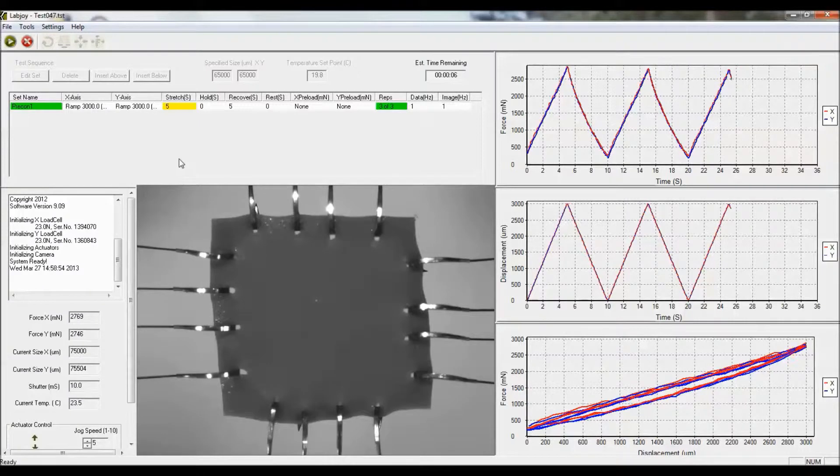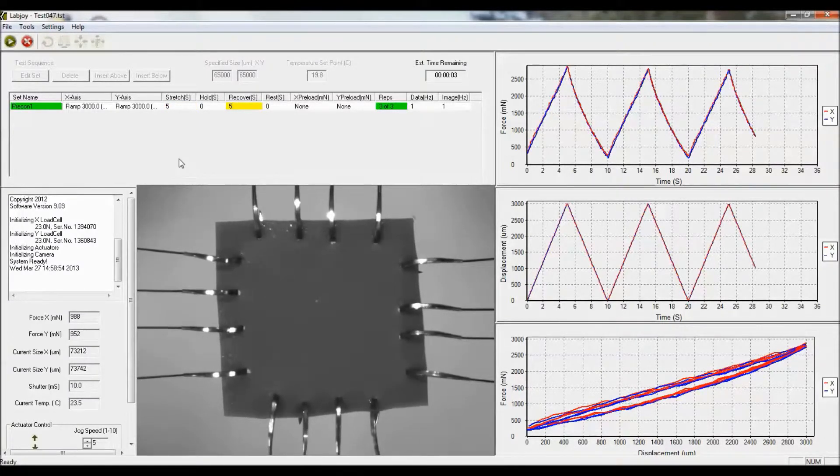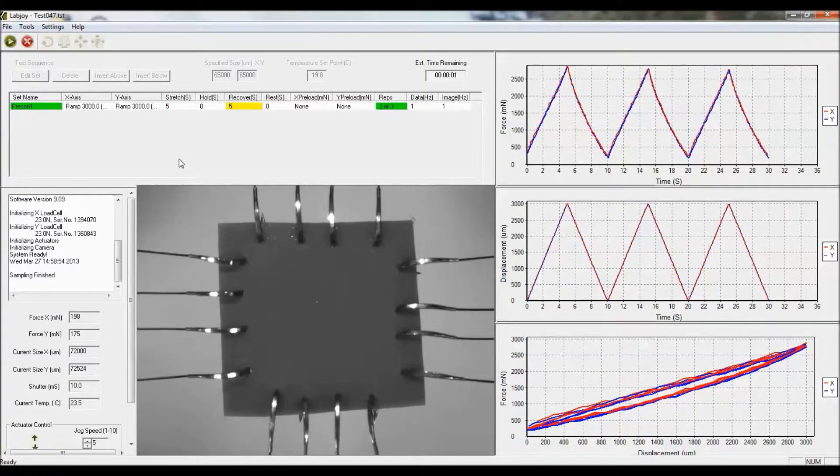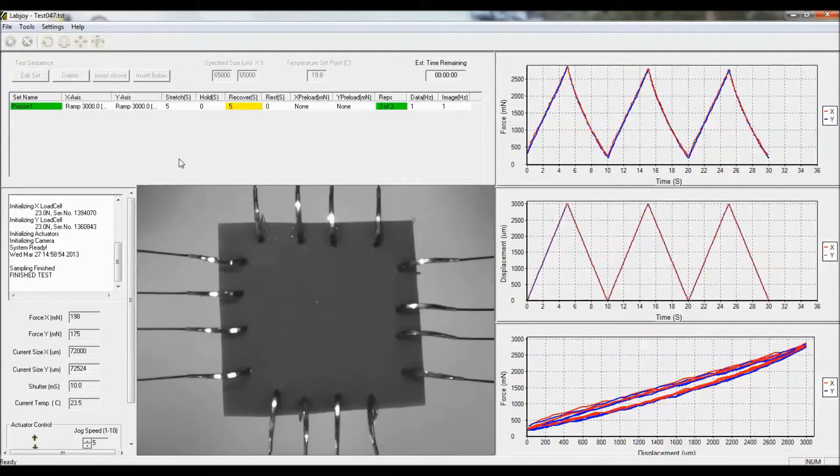This test is going to run out here. You can see the live video feedback as well. All the data is being collected and written to my hard drive for later analysis.